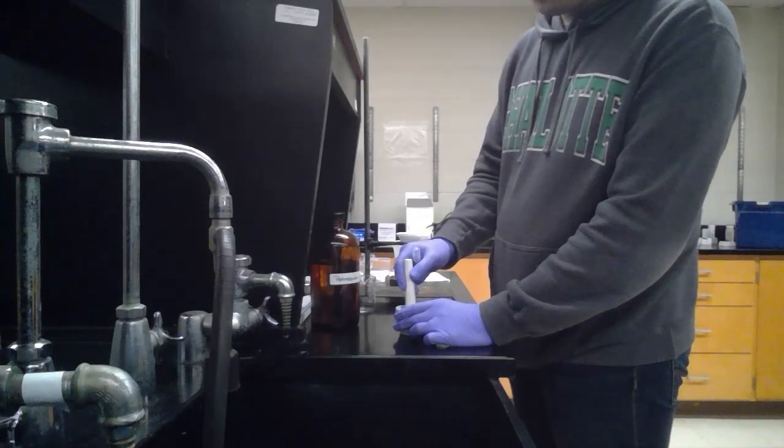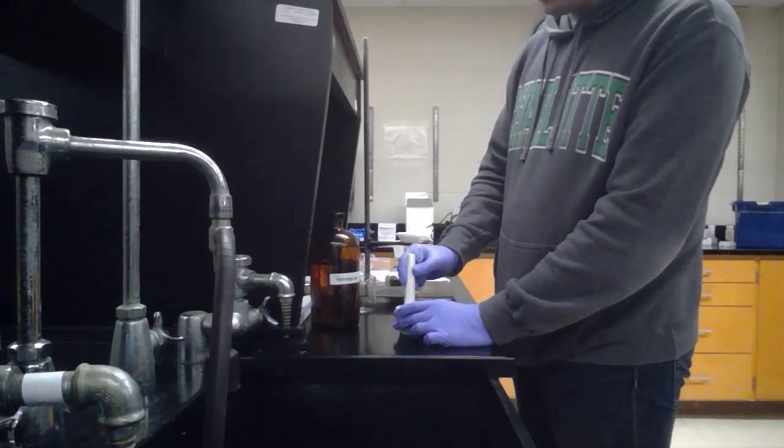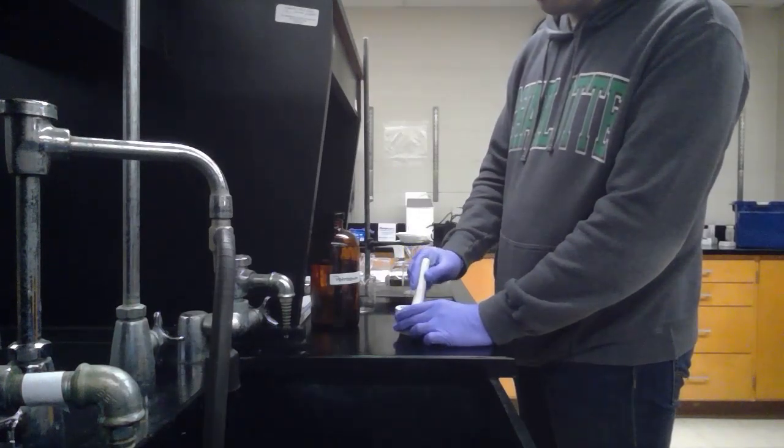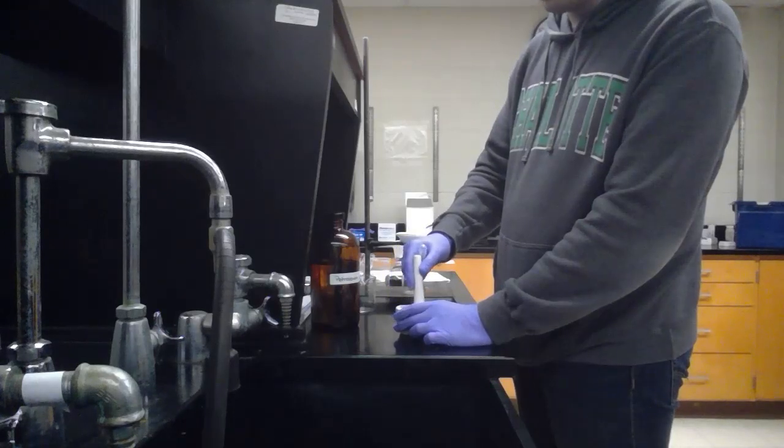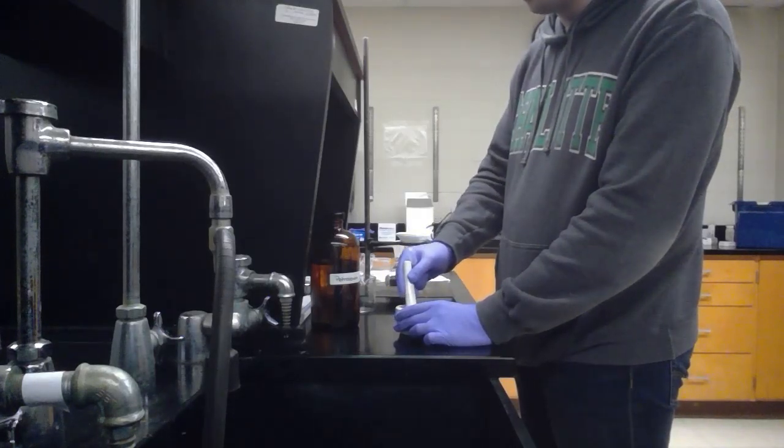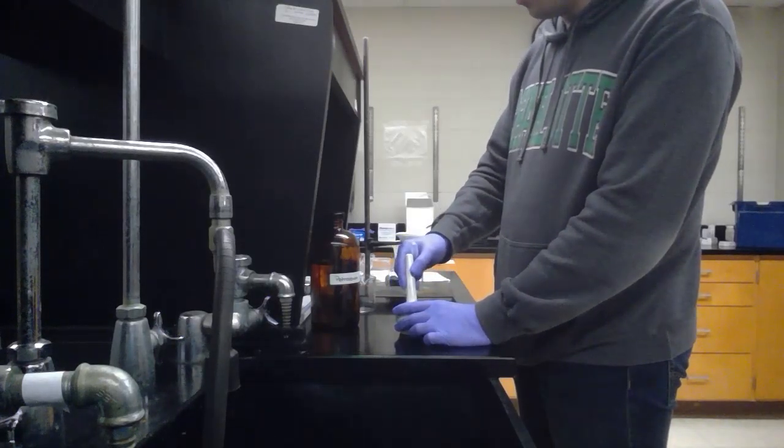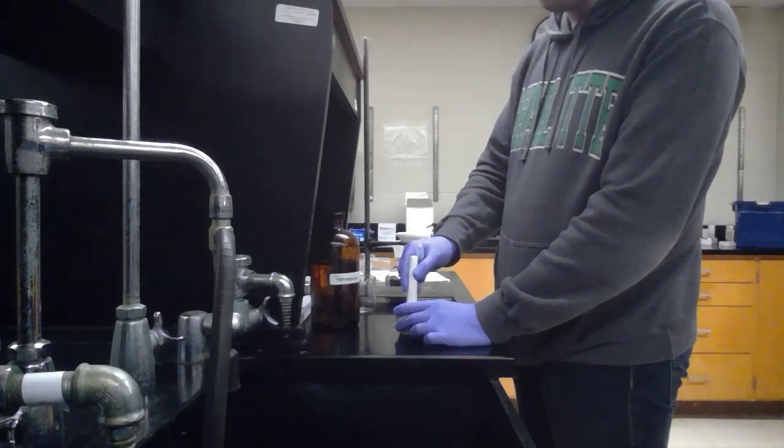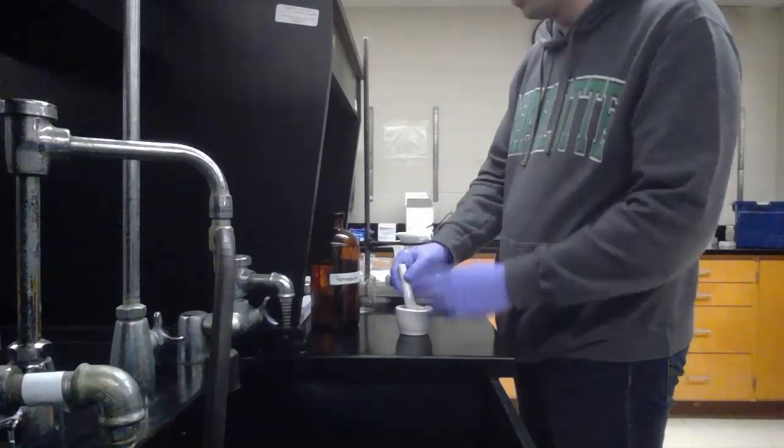Basically we're going to dissolve everything, try to get as much of the fat out of here as possible. But remember, we're going to do this two more times, so it's fine if you don't get everything out the first time. And then we're just going to pipette all the liquid off the top of it and filter it through this funnel.